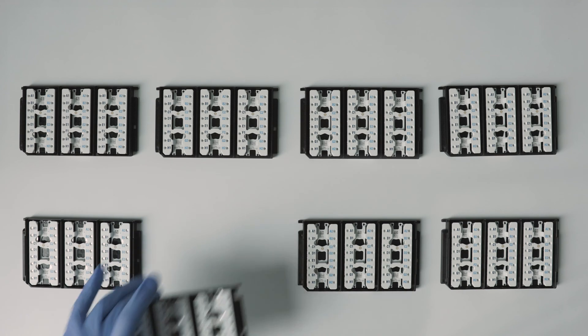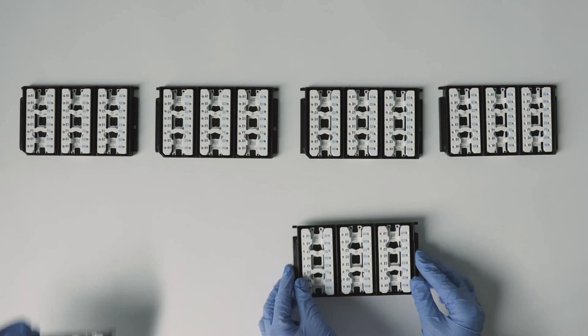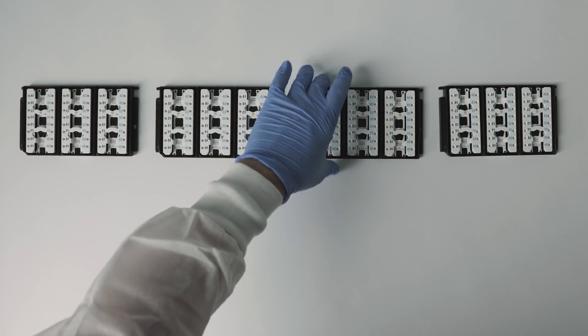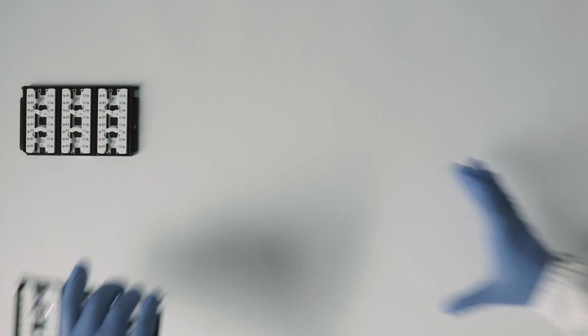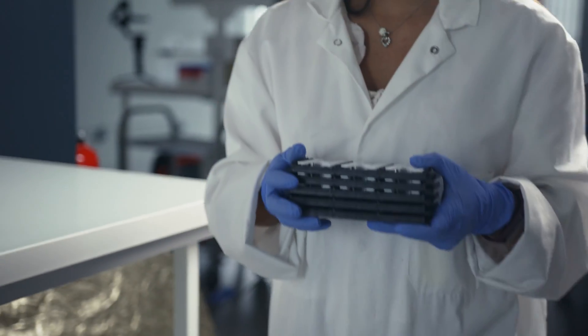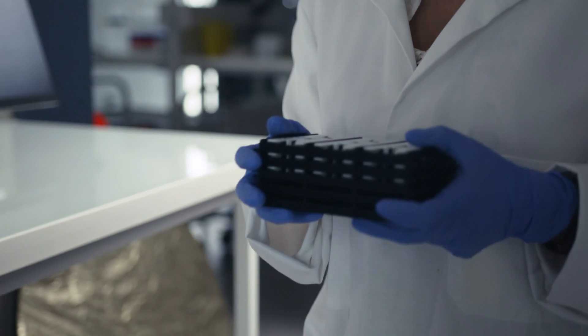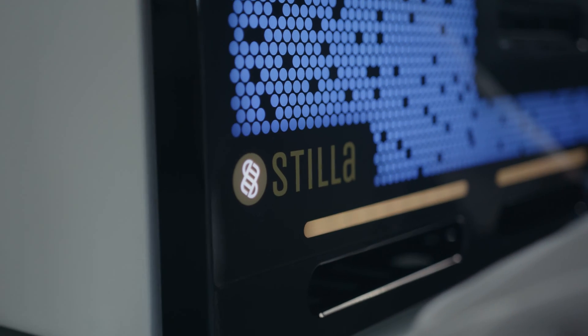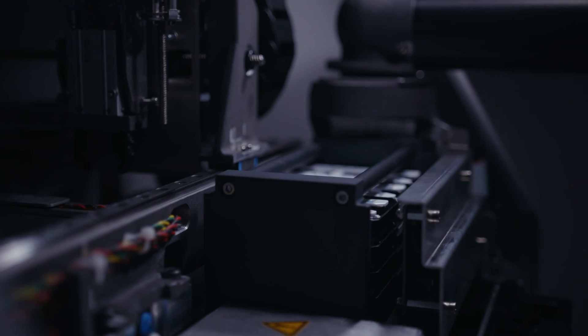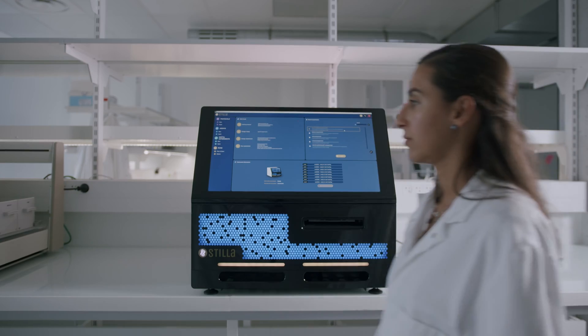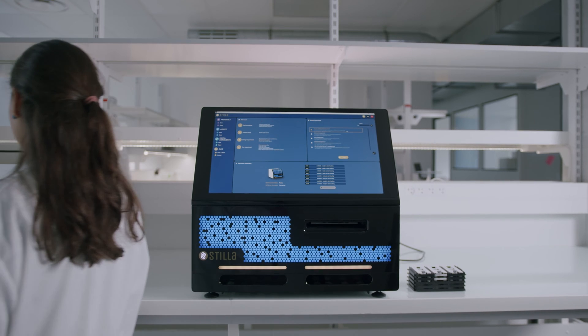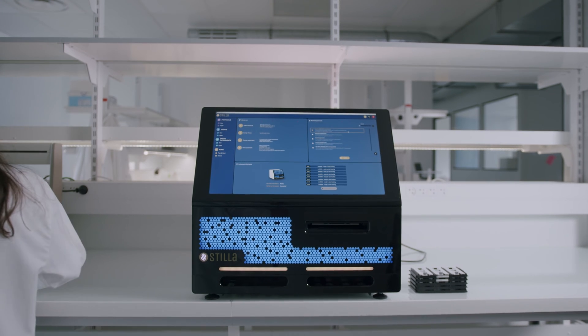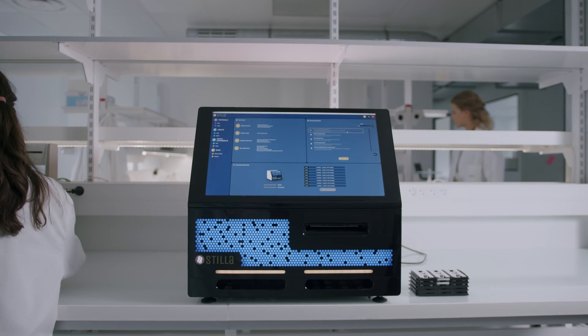But it's not just you, is it? There are about eight of you, and when everyone wants a piece, NIYO Plus is there to keep the peace. You can load up to eight chip plates concurrently and let NIYO Plus's dual thermocyclers process them automatically. So you can choose to work on your own, work with a colleague, or bring in the entire lab.